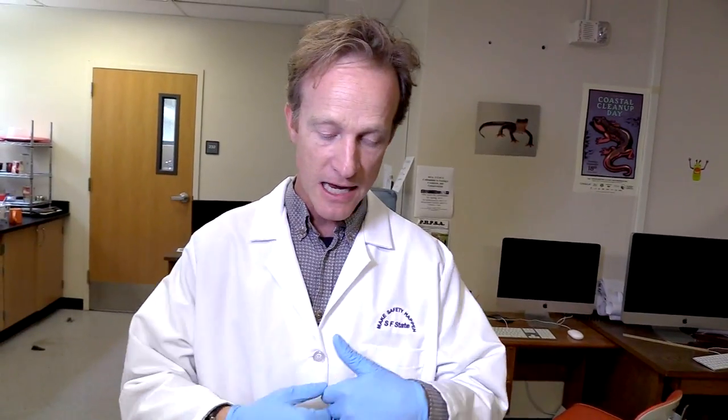My name is Vance Vredenberg. I'm an amphibian ecologist, and I'm going to collect a skin swab from a terrestrial salamander found here in California. It's a technique that works really well because it doesn't harm the animals, and we can collect a lot of these data and release the animals back into the wild and look at disease dynamics in natural populations.